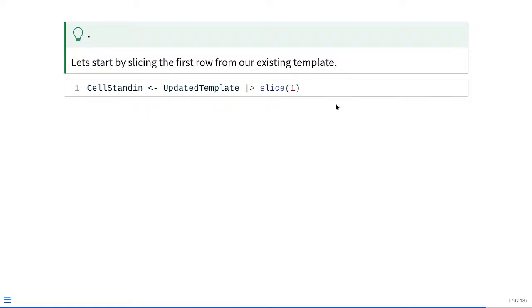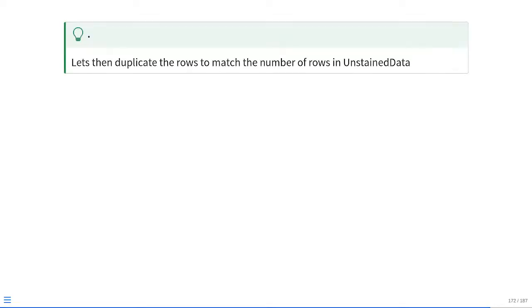We're going to use the little slice function in this case. And as you can see, for our single colors, it's expecting this format. It's expecting a name column, a fluorophore column, an antigen column, a type column, a detector column, and a negative column. At which point it will have all the different signature columns that we are more than expecting for the individual fluorescent detectors. So basically what we should do is we currently have that individual row.